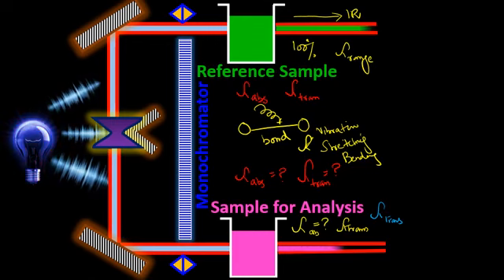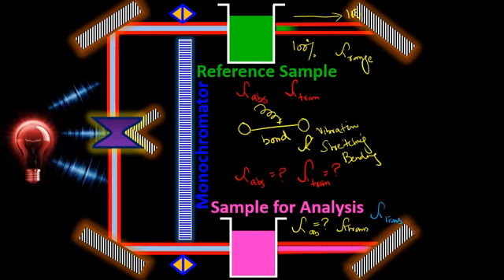Now the transmitted infrared radiation from the reference sample and from the sample under analysis will move along the forward direction, and they will interact with mirrors. The mirrors used in the IR spectroscope are used for deflection. So these mirrors will deflect incident radiations.